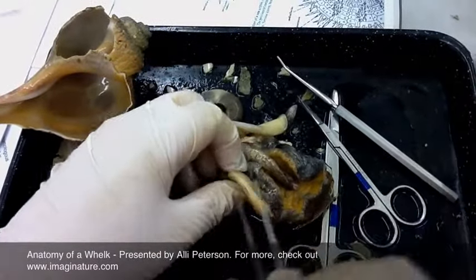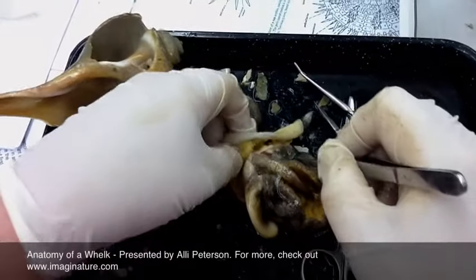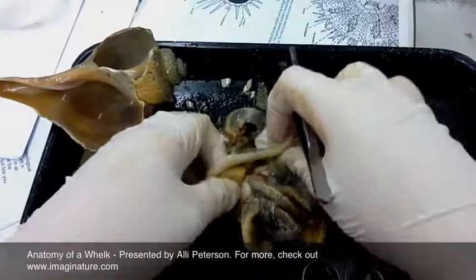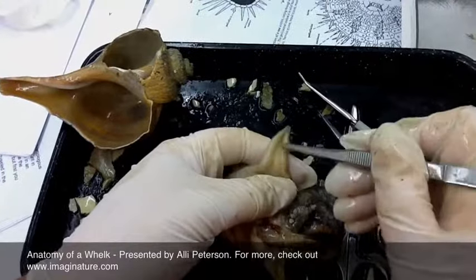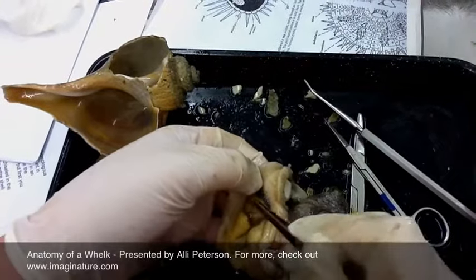This here is the male sex organ, the penis, with the gonadopore at the end. As we travel up the whelk, here again is the siphon. And right here we see the gills.